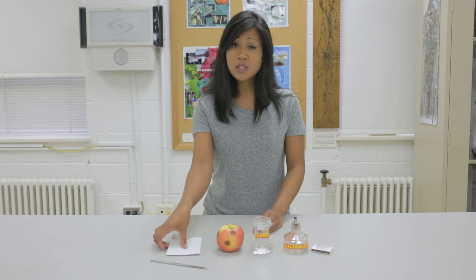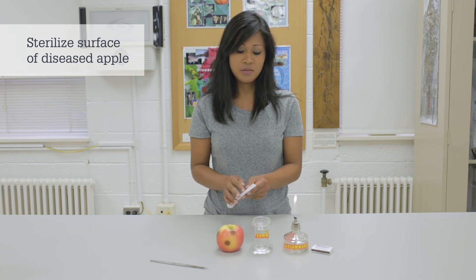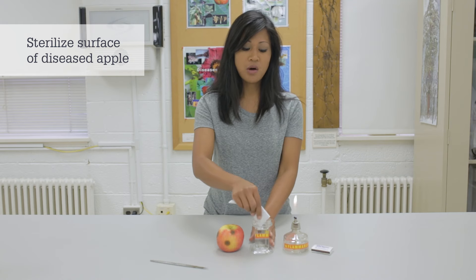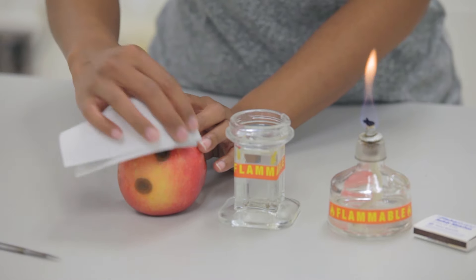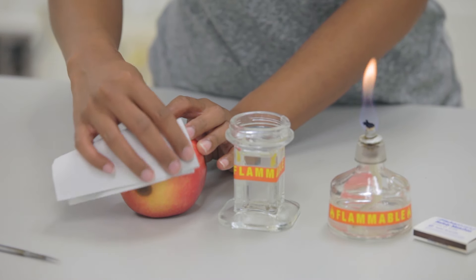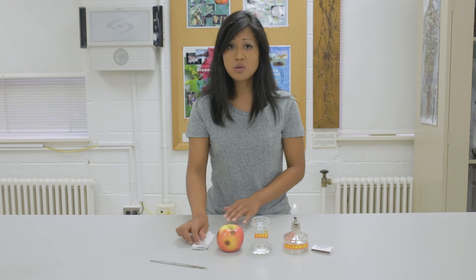The purpose of sterilization is to minimize contamination from other microorganisms that might be present. We'll start by sterilizing the surface of the apple by taking a paper towel, dipping it into 95% alcohol, and gently wiping the surface from which we are going to isolate.